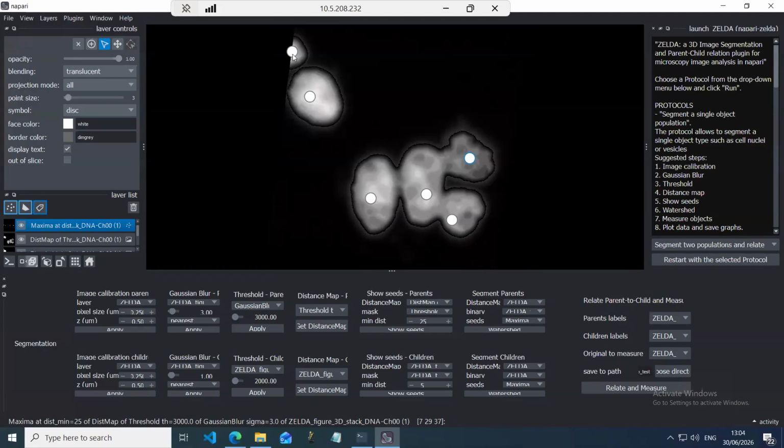For the other object, I have a point here. This should segment in a sufficiently good way this cell, but I also have a point here at the periphery, which will generate a cell that is just cut out of the data set. So it's good not to measure it because this could introduce a sort of outlier in the data. So what I can do is I select this point and I can delete it. So this summarizes a bit what could be the manual editing in case the result is not the expected one.